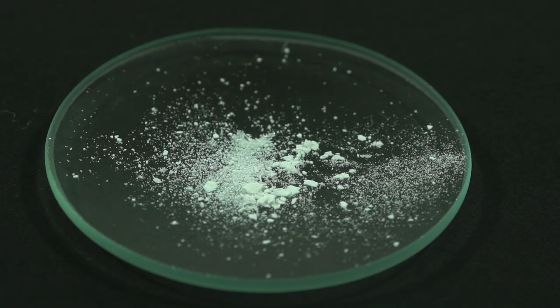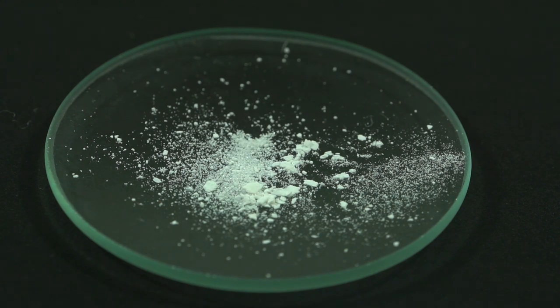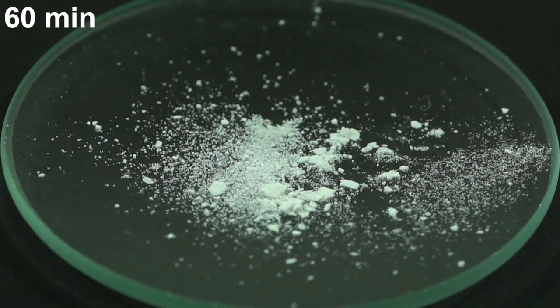Chromium hexacarbonyl is white crystals, they are very volatile. Even at a temperature of 20 degrees Celsius you can see a noticeable amount of substance evaporating in an hour.